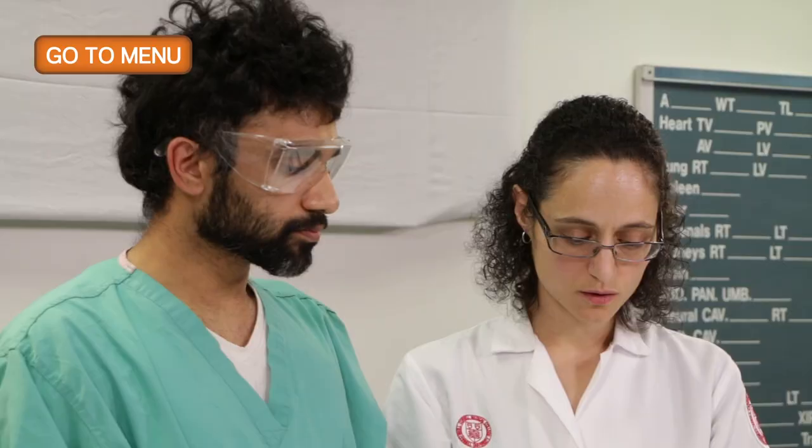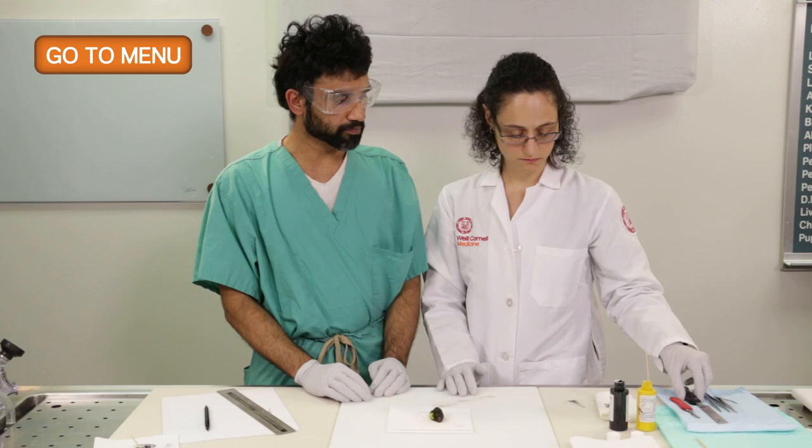Actually, I'm not familiar with that. So in general, the larger a nodule gets, the more likely there's bulging of the nodule. Especially if it's a single solitary lesion, it's potentially encapsulated. If you cut it coronally, you'll get less bulging, and you'll be able to visualize the capsule better. When it's less than 2 centimeters, that's less of a complication, and so we can do transverse sections. But since it's greater than 2 centimeters, we'll do a coronal section.